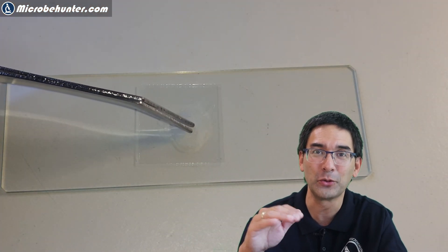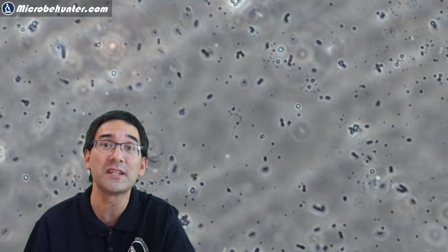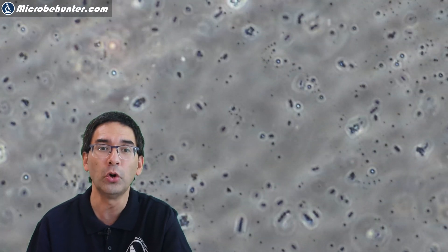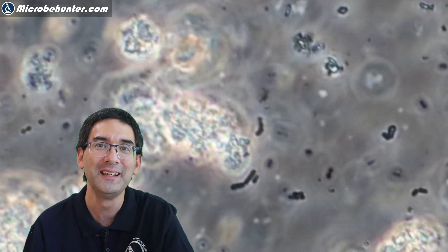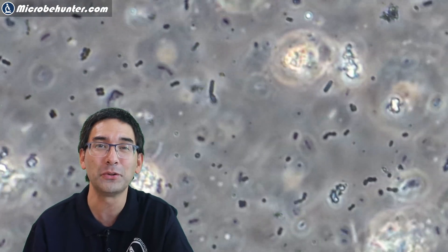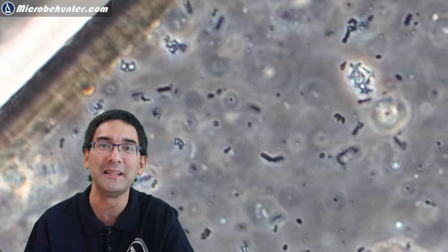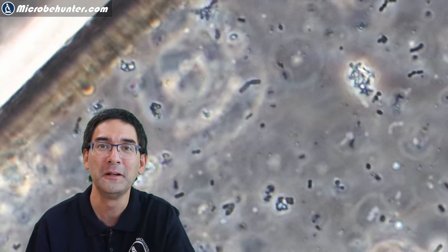When you put it under the microscope, you see our little friends again — the bacteria. Something quite interesting: I did actually see some of them moving around. These are so-called rods — the long, elongated bacteria. And here we have one that's moving around. As a matter of fact, it looks almost like there are two of them — maybe it's in the process of division. It's clearly visible that this is not just random movement; this one has directed movement that I was able to see.